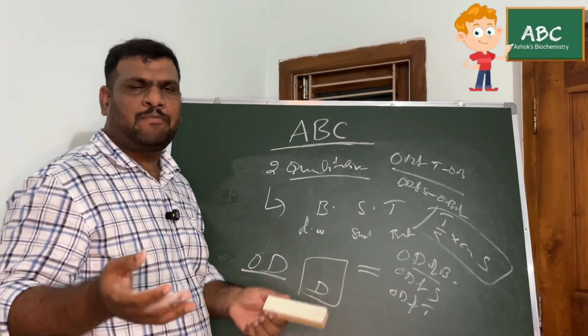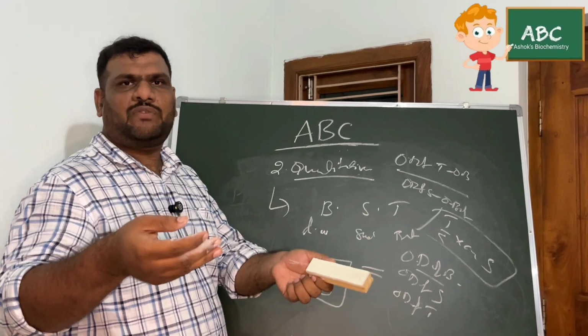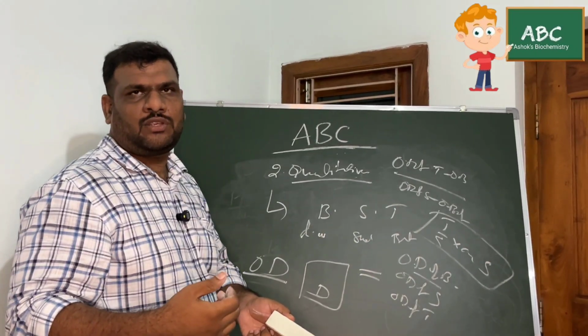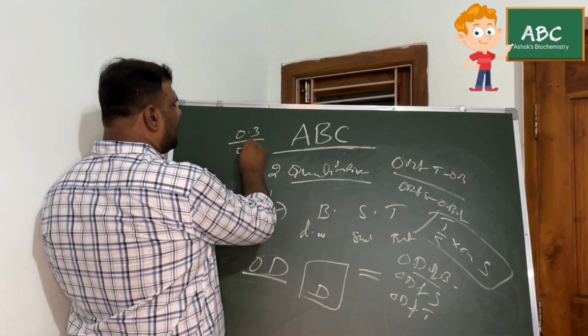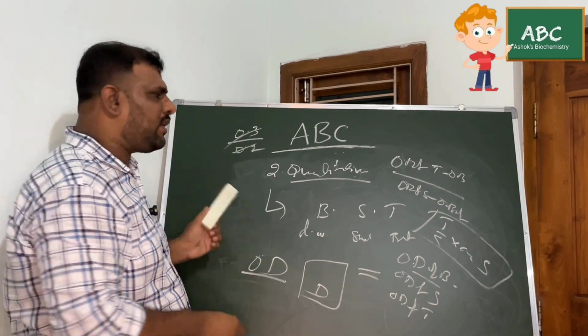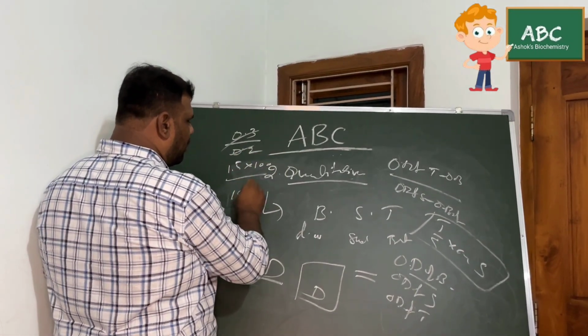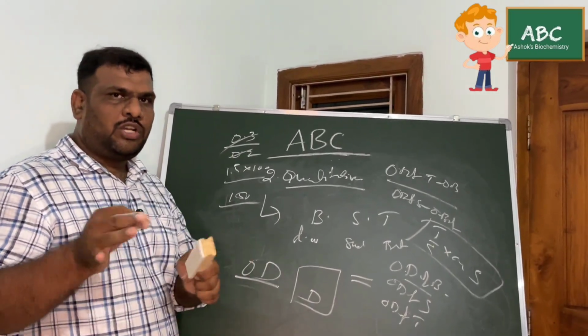For example, I got a standard of 100 grams of glucose and a test of 150 grams of glucose. So for 150 and 100, you will have a difference between the ODs. For example, it may be 0.3 divided by 0.2. So you do the calculation and you get 1.5. The concentration of the standard you already know, 100. 100 into 1.5, you got 150. Direct answer. You can do it very easily. No need to panic about that.